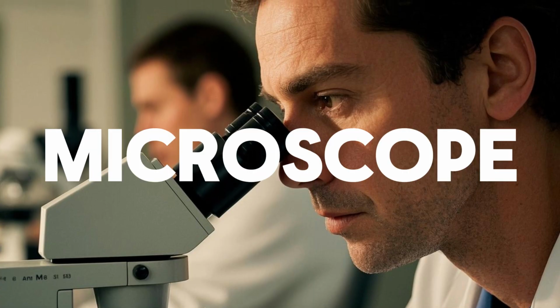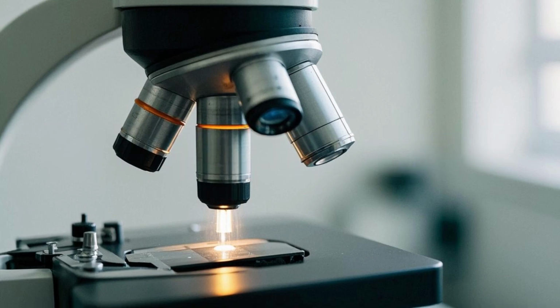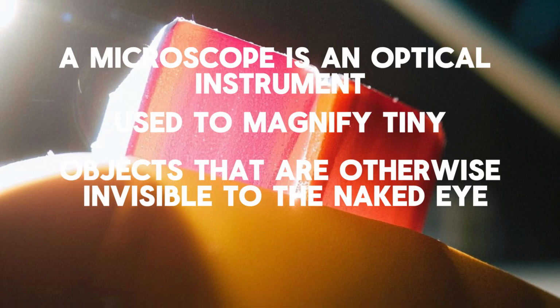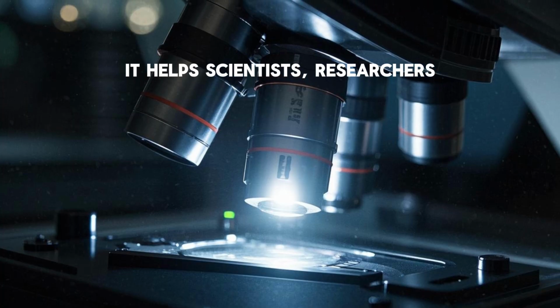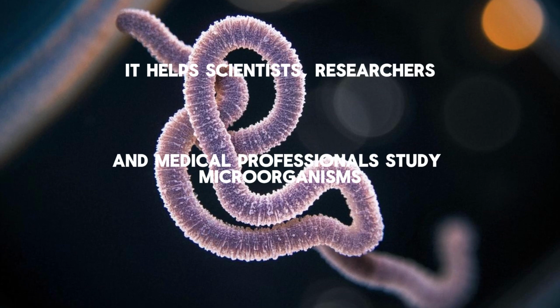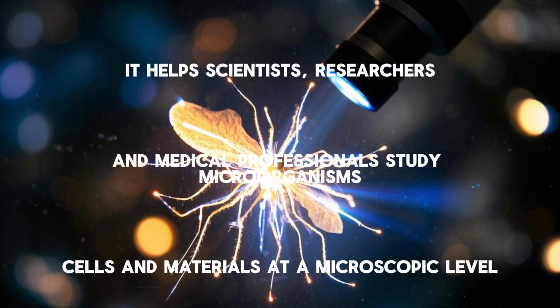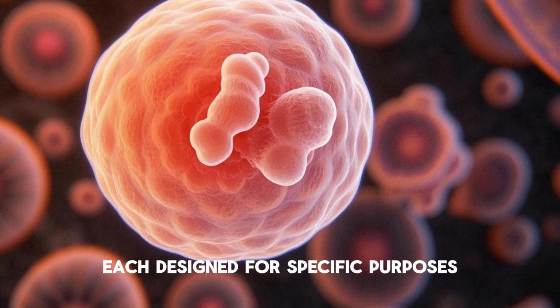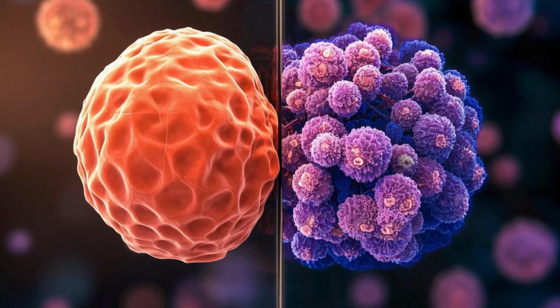Before we dive into the different types, let's first understand what a microscope is. A microscope is an optical instrument used to magnify tiny objects that are otherwise invisible to the naked eye. It helps scientists, researchers, and medical professionals study microorganisms, cells, and materials at a microscopic level. There are various types of microscopes, each designed for specific purposes. Now, let's explore them one by one.